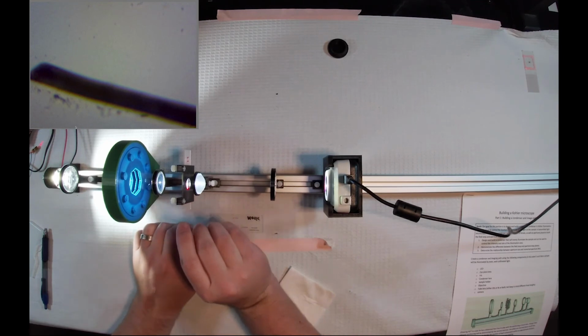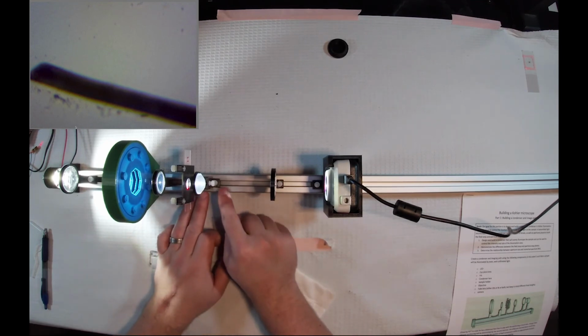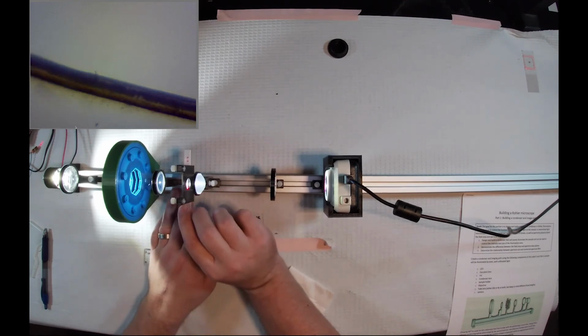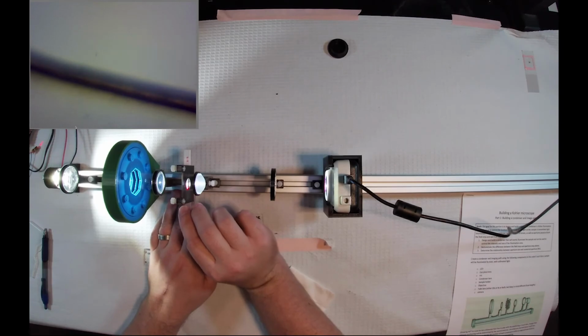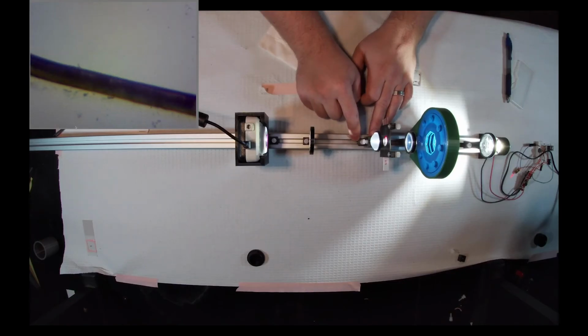There we are. So my hair is dirty blonde, not the most pigmented of hair colors. But you can see that in this setup, it does look relatively dark compared to the background. You should note that is what Brightfield really tells us, simply the absorption and scattering properties of our sample, right?